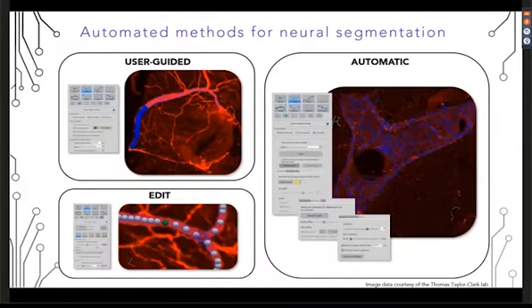So we've covered how to contour regions and mark cell bodies using MBF Bioscience's tools. Next, Macy is going to show you how to segment and edit neuronal structures in Neurolucida 360.